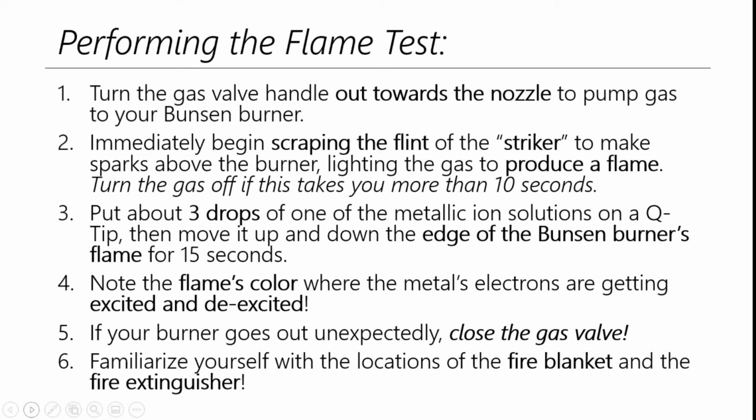Now, if we tried to stick the Q-tip directly into the flame, it wouldn't do much good, because we'd see a whole lot of light coming from the burning of the Q-tip and not from the electrons getting excited from the metal. So we again want to just go up and down the edge. If your Q-tip is burning, you've got either not enough liquid on there, not enough of that dissolved metal, or you have put your Q-tip too far in. It might take a little bit of time for the color to show up, but it will show up.